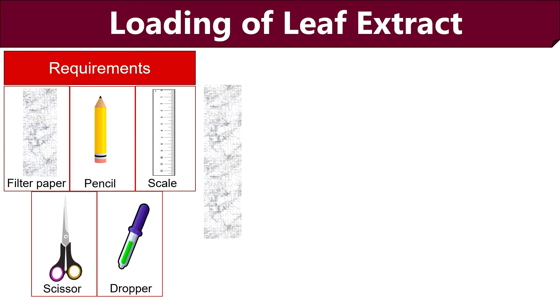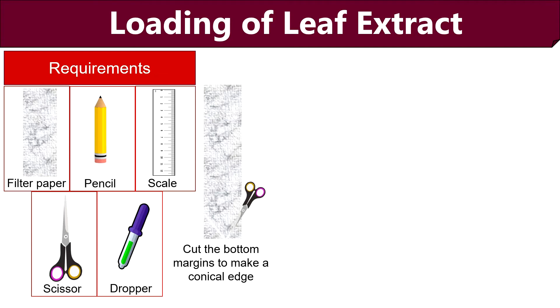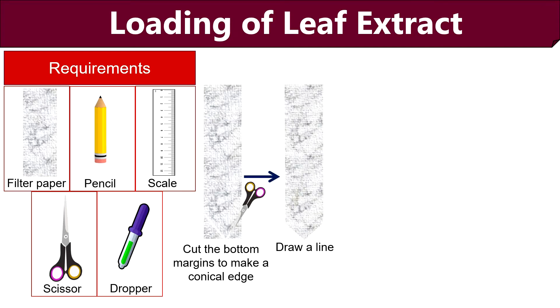To load the leaf extract, we need Wattman filter paper. For better results, we can cut the bottom margins to make a conical edge. Then using pencil and scale, draw a line above 2 cm from the bottom. Here pencil is used because pencil marks are insoluble in the solvent.